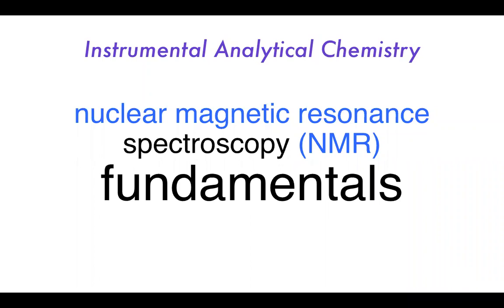I mean, we've talked about UV-vis spectroscopy. We saw that was not really very good for qualitative analysis. It was good for quantitative, very good for that, whenever we want to find out how much of something there is. But whenever we're talking about qualitative analysis, identifying something, UV-vis wasn't particularly good. FTIR was much better than UV-vis because of the way that it looked at the bonds in a particular molecule, but it's relatively complicated. There's a lot going on in those spectra. There's a lot of overlapping peaks.